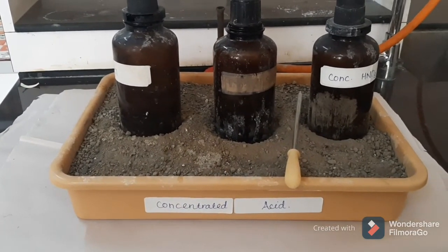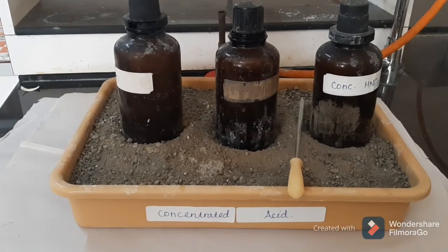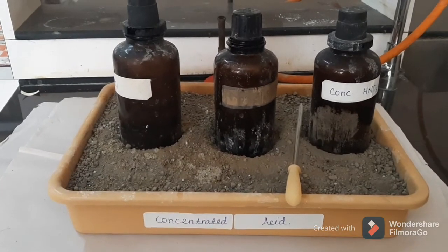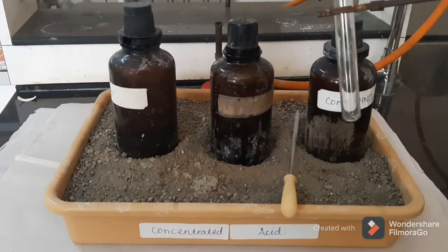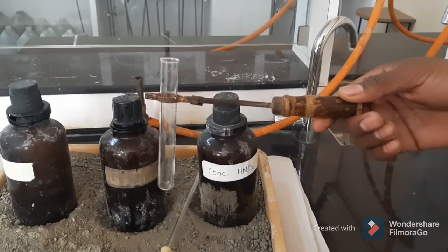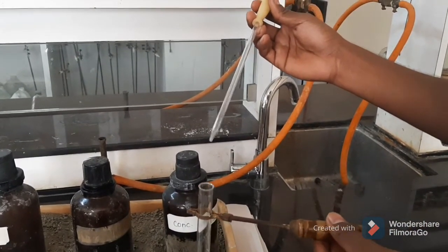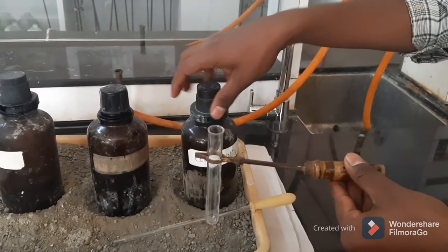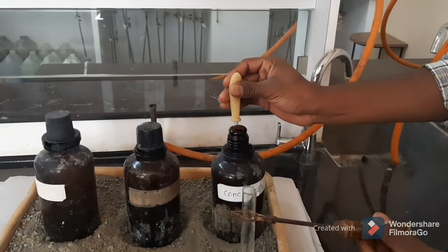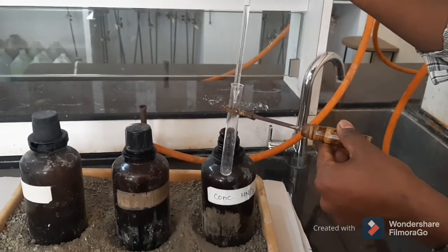If we handle them carefully, there is nothing to fear. Whenever you are using concentrated acid, you must use a test tube holder. Always use a dropper — never pipette out any concentrated acid by mouth. Do not use a pipette for dealing with concentrated acid; use a glass dropper, and a test tube holder is a must.